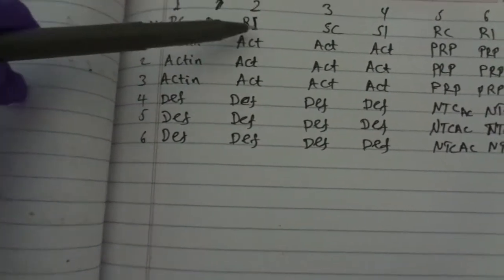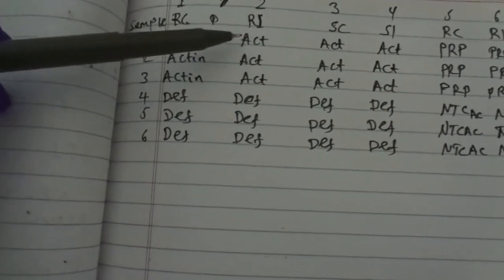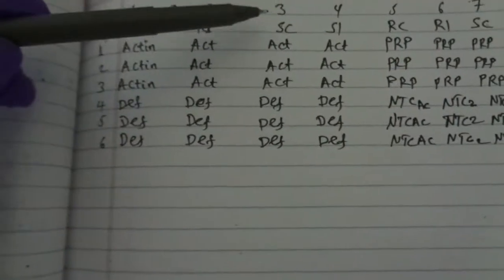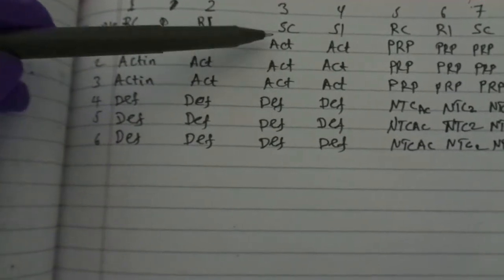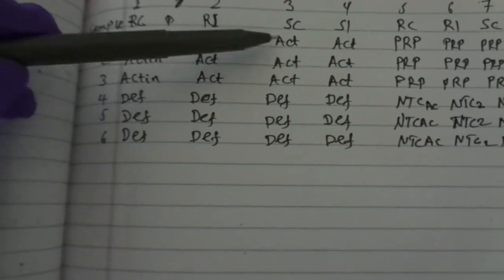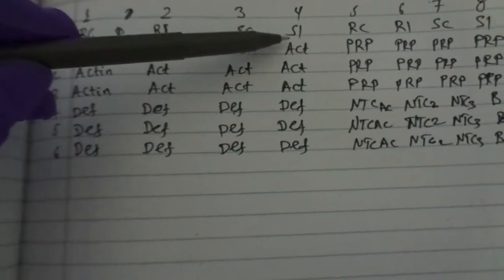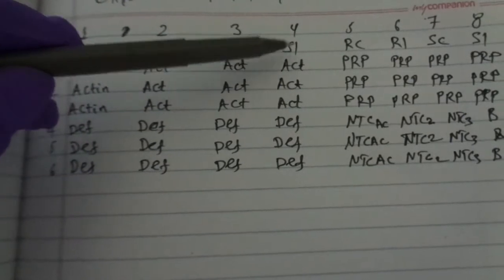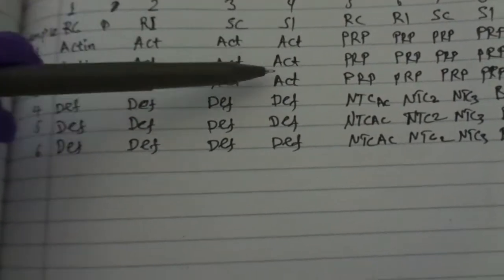And for the second sample, the resistant infected or treated with pathogen, actin has 3 replications there. And the susceptible control, also the actin gene is replicated 3 times. For susceptible infected, that means susceptible inoculated with pathogen, actin is replicated 3 times.